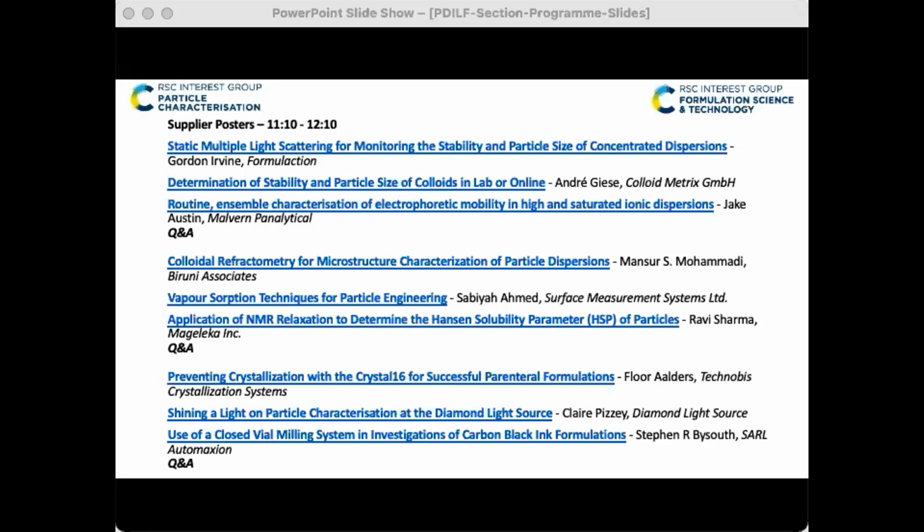What is the material construction of your vials? Are they expensive or are they cheap? Disposable? That's one of the points of what I do: it's your vial. I don't care what the vial is. You tell me what you want to use. For a catalyst application, we've used plastic vials. But usually it's glass. You also have to remember that you can't put in the vial something that will have too much momentum and will break a glass vial. So smaller beads or less heavy beads. If you put a big metal bead in there, the vial will smash if it's glass. But of course it won't if it's plastic. So whatever you want.